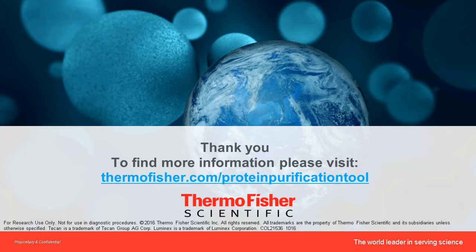Thanks, Bhavin. And our next question asks, what's the sensitivity and dynamic range of targeted MS assays for AKT-mTOR pathway targets? Is that something that you can answer, Bhavin, or is that more for Andreas? Yes, for Andreas. So what we typically see in our assay is on-column sensitivity of about 80 attomoles to about 500 femtomoles for those AKT targets in the pathway using mass spectrometry. In this case, it was an Orbitrap mass spectrometer.